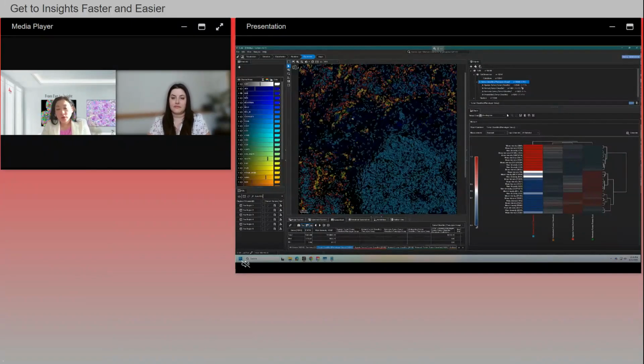And if you recall, in the actual model, the authors trained Cellpose on many different varieties of cell types, including some elongated ones as well as some cells with irregular borders. They even trained using seashells and different types of objects that are not cellular at all.